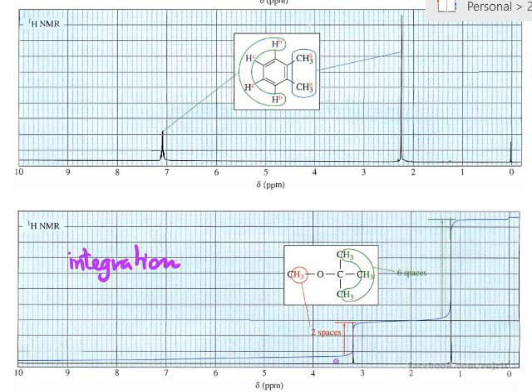So here in the structure, you have the methyl group CH3 in red color, which is here on the left hand, and the green color on the right hand. This is because the green color is sp3 carbon, normal, appearing at 1 ppm, but the red color is the methyl group attached to the oxygen atom, very high in ppm, right?